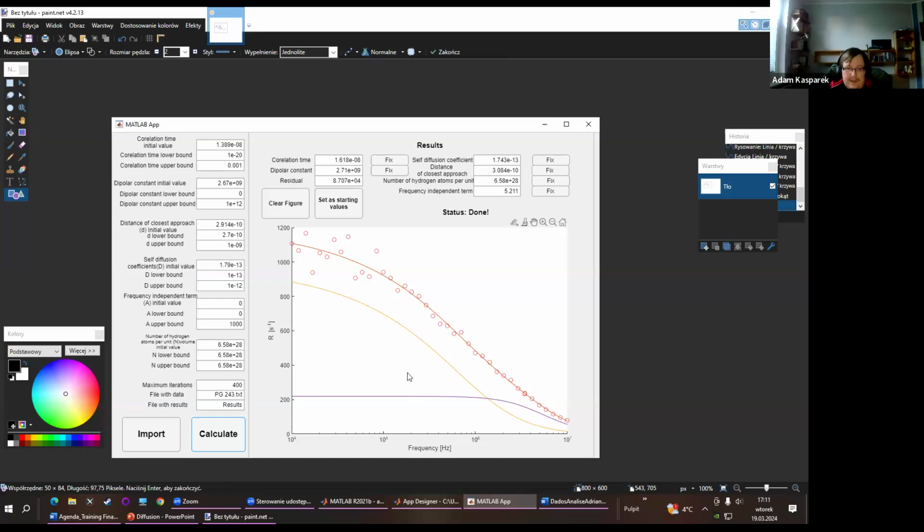Okay, and frankly, we got slightly different results. The diffusion coefficient we got is a little smaller than before, I believe, because before it was 1.79, and the distance of closest approach goes a little up. So it changes a little. But to be honest, looking at the parameter I check to see which fit is best, which in my program is the residual, the change wasn't substantial.